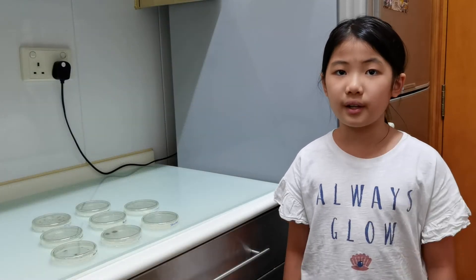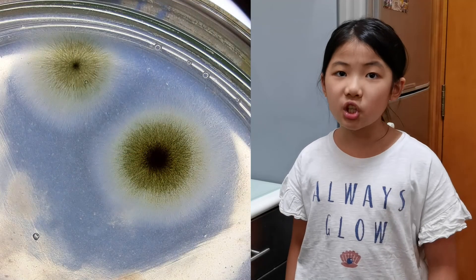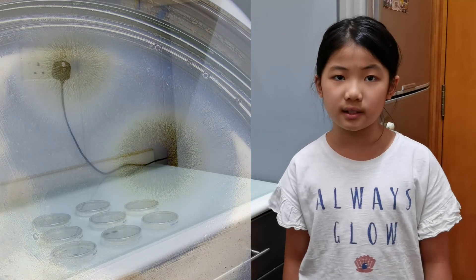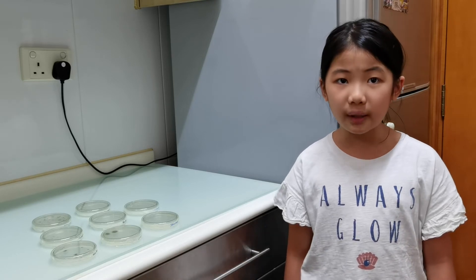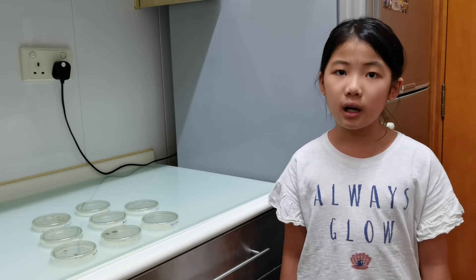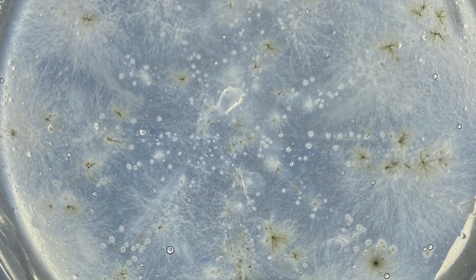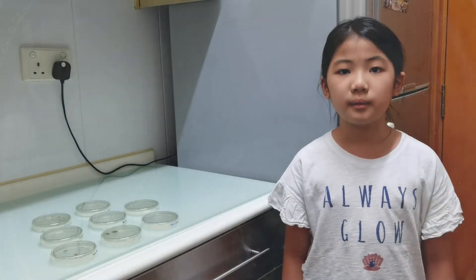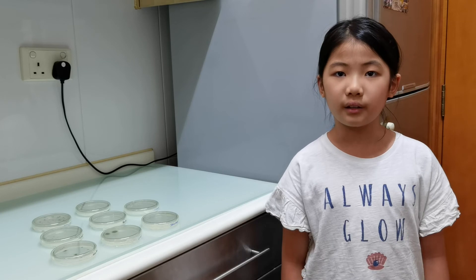There are lots of unexpected results. I thought the iPad was clean, but in fact it was very dirty — it has two big fungal colonies. Some of them are dirtier than I have imagined, like the toilet bowl and the cutting board. Although the cutting board has lesser bacteria, it has much more fungi than the toilet bowl, meaning cutting food on the cutting board is probably not much different than cutting on the toilet bowl.